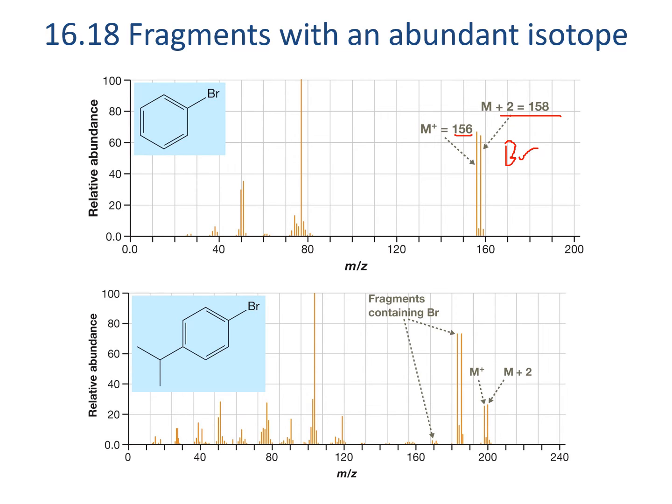Notice that there's other groupings around here. The spectrum's not clean. There are lots of different things that can happen in really small amounts to a molecule, but we're looking for the major peaks in each region.